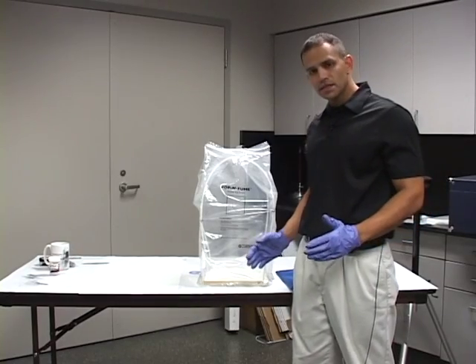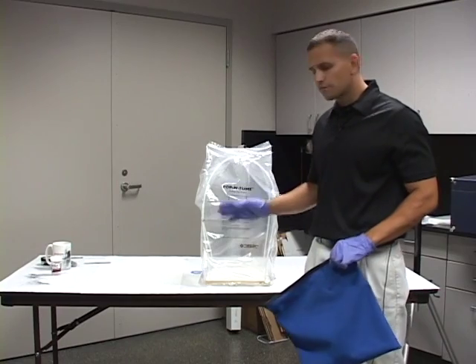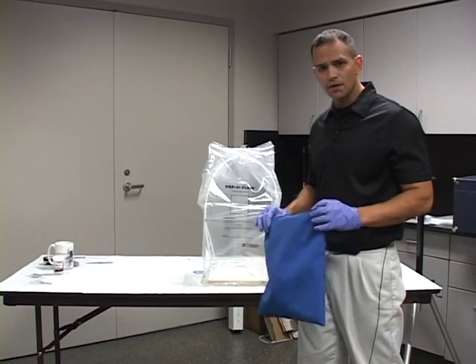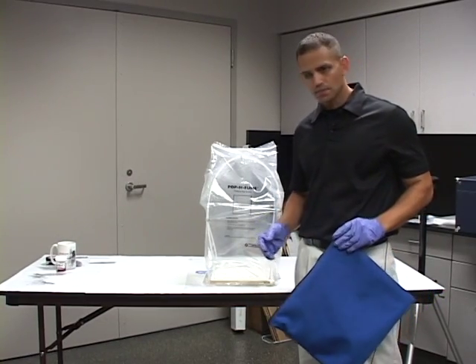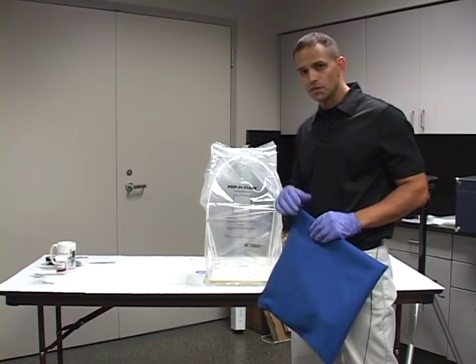And there are our fingerprints, visible on our mug. So I showed you very easily how you can make a portable fuming chamber. It took a few seconds to set it up, a few seconds for the activator, and it fits in a pouch — you can take it anywhere. I'm going to get back to processing my evidence. I thank you for joining us and hope to see you in my next series.